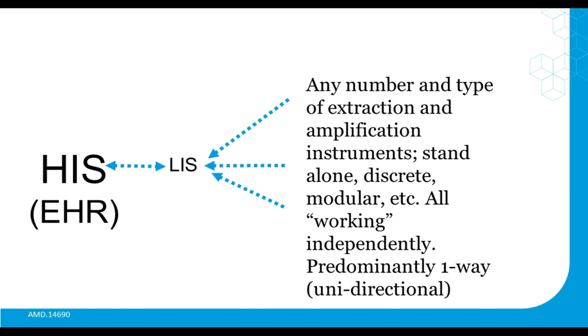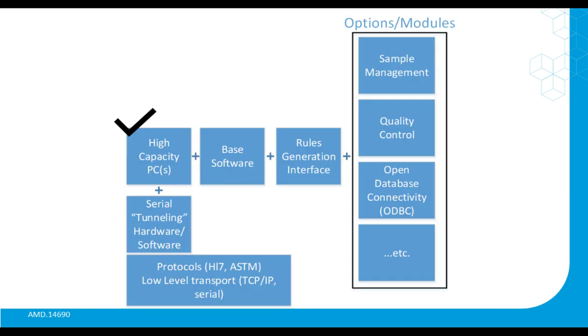The LIS alone really isn't capable of many of the facets of information management, categorization, and reporting. So I may draw some criticism for that statement, but it's why middleware is popular and gaining popularity in the laboratory. So let's finally turn our attention away from all the history and anecdotes and talk specifically about middleware.